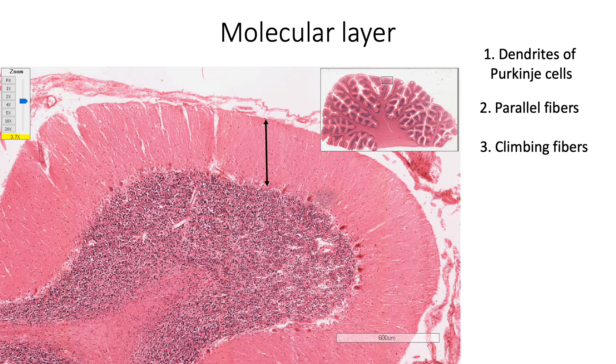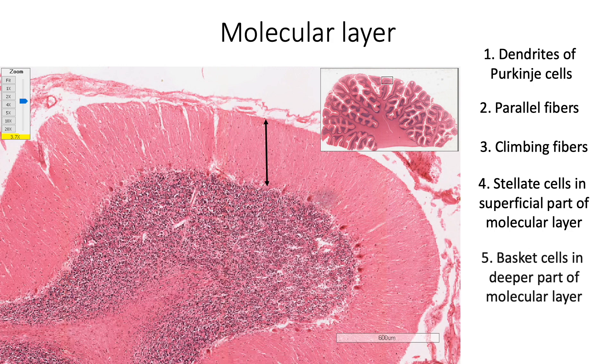It also has cell bodies and processes of two types of interneurons, namely stellate cells, which are found close to the surface of the cerebellum and basket cells, which are found in the deeper part of the molecular layer. Both these cells are involved in feed forward inhibition of Purkinje cells. In addition, we also find neuroglial cells in this layer.